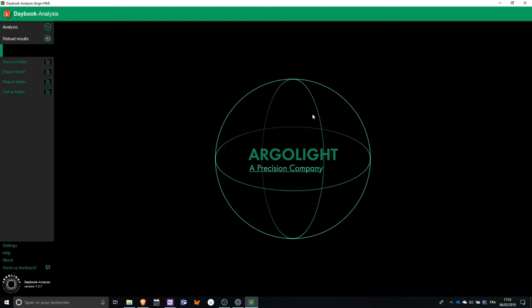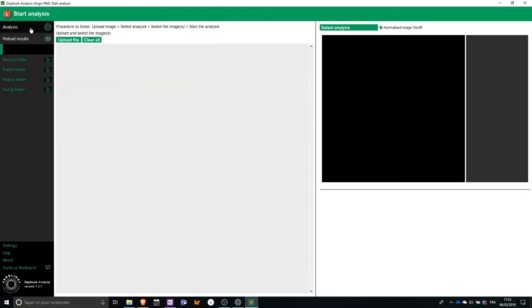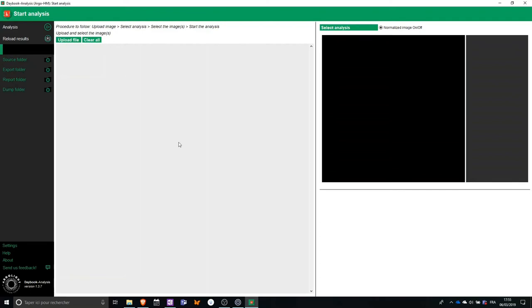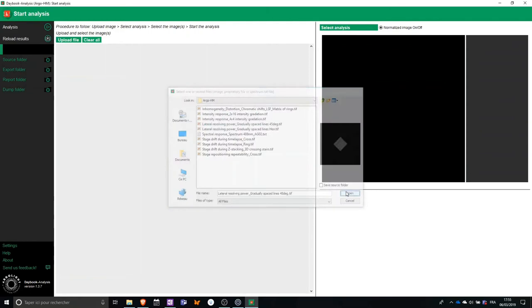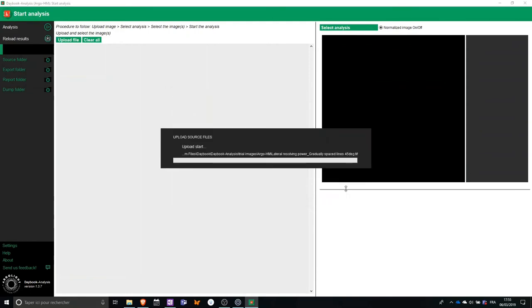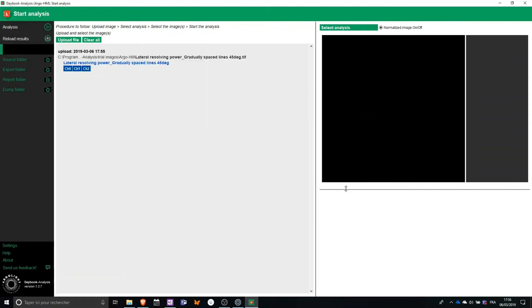Once I have my images, I click on Analysis. I've got two panels, a listing of files here and a preview panel here on the right. To add a file, I click on Upload File and select the one I want to upload in the software. Daybook 2 is compatible with a large number of file formats including proprietary formats such as Leica, Zeiss, Nikon, or Olympus.